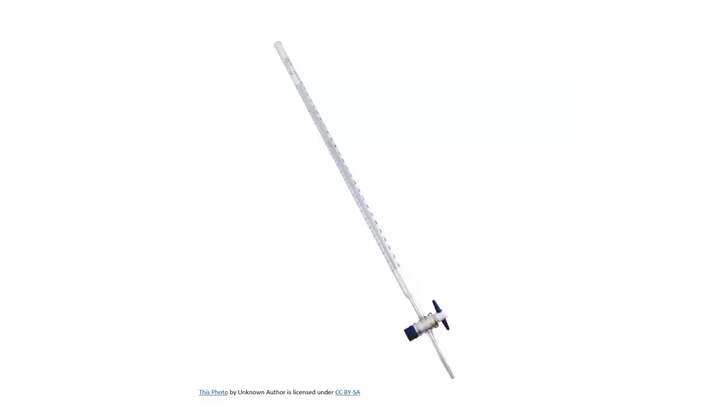But back to the burette. Once we're done, we've read our burette, we're getting ready to clean our burette, you're going to empty the burette into your waste container that you have been using the whole time. You'll rinse it out with water, and you can use tap water for that, but that waste also needs to go into a waste container. Then you're going to rinse it.